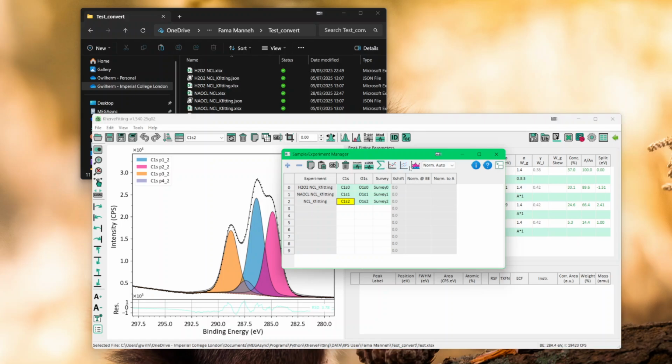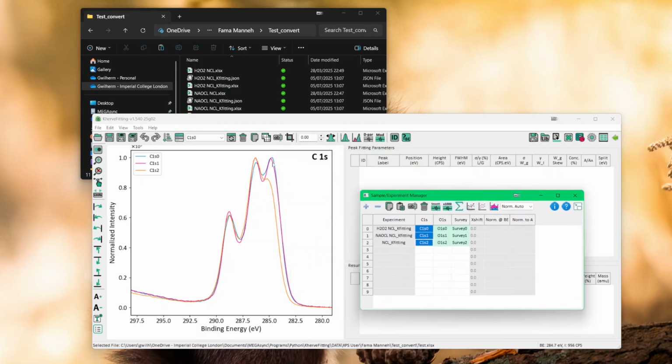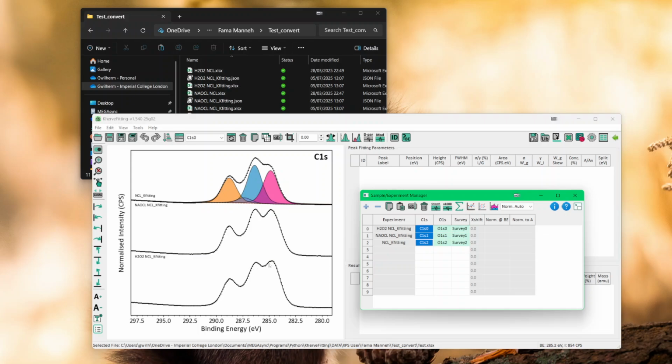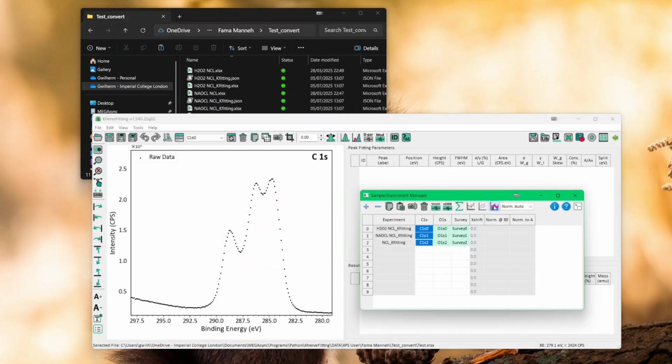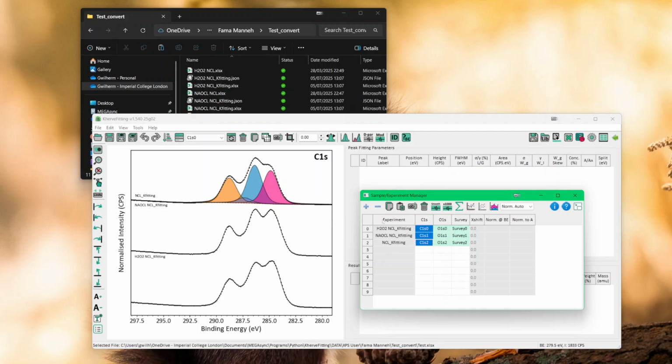Okay, and then you can obviously use the different functions. Look at the plot normalized to the maximum area, or create an offset, or use the fitted stack plot. Obviously, this has not been fitted, so that's why it shows it like that. If you double click, you get a slight offset, as you can see, and you can continue. So if you click once, it goes back, and then twice it keeps getting higher and higher. And as you can see now, this is done. So if I re-click once, it just goes back to normal. So that's how you create multi-samples of KherveFitting.